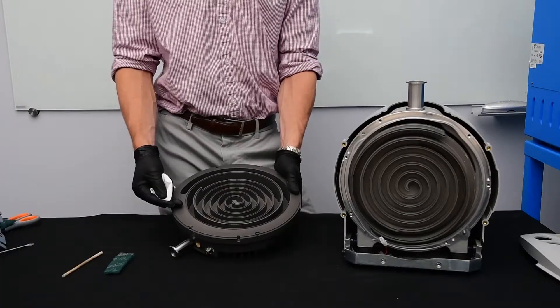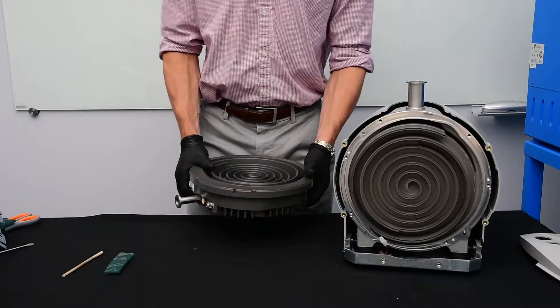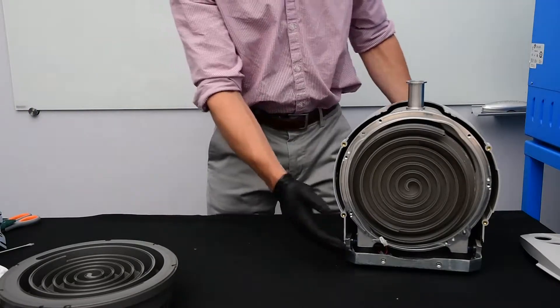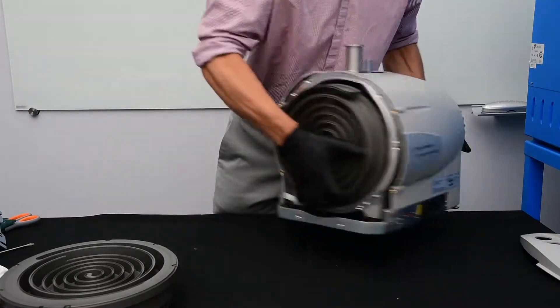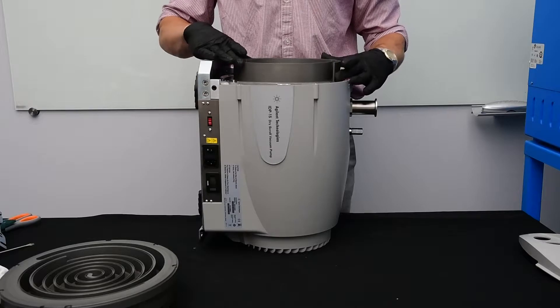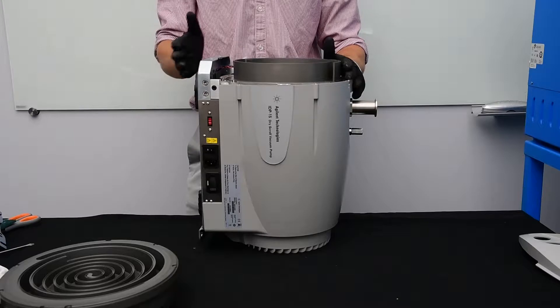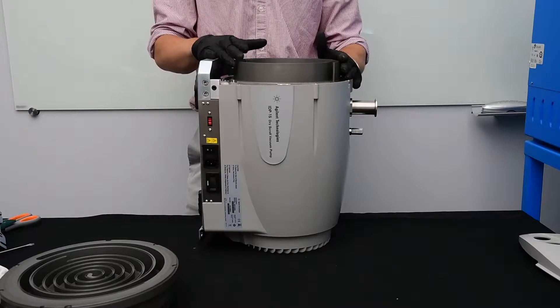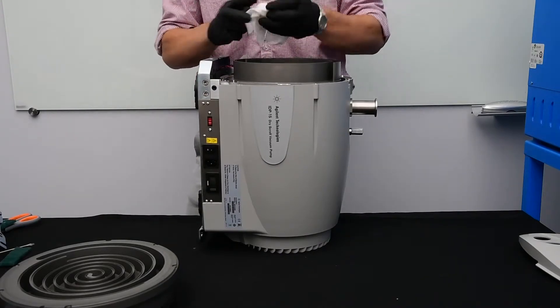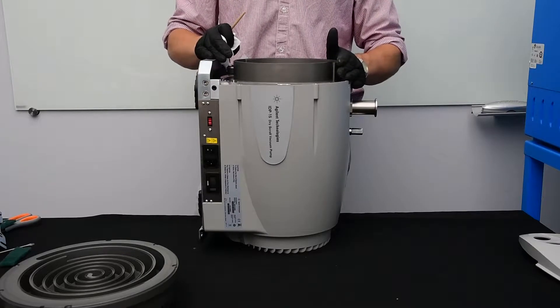Now that we've finished cleaning the outboard housing, we're going to move on to the orbiting plate. The pump has a flat rear so you can stand it on end. This gives easy access to the orbiting plate. We're going to follow the same procedure as we did for the outboard housing on the orbiting plate in order to clean the scrolls. And now we've finished cleaning up the orbiting plate of the IDP15.